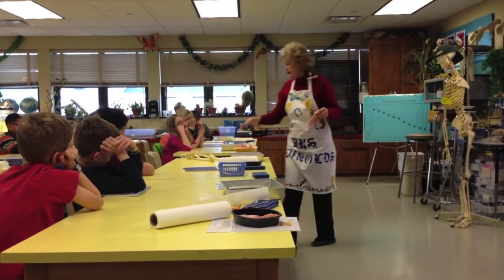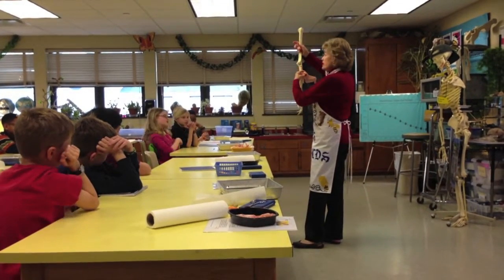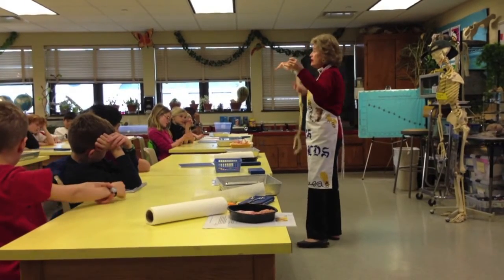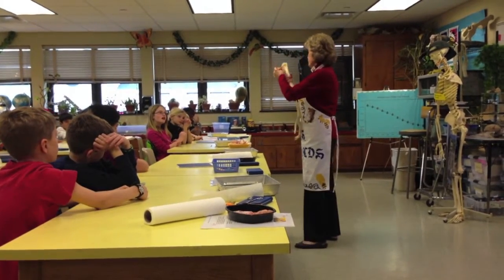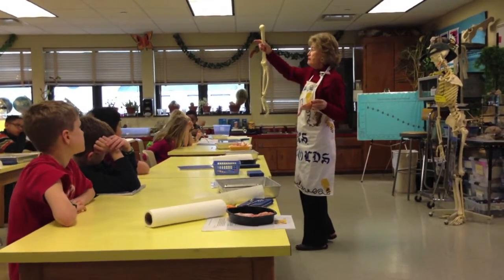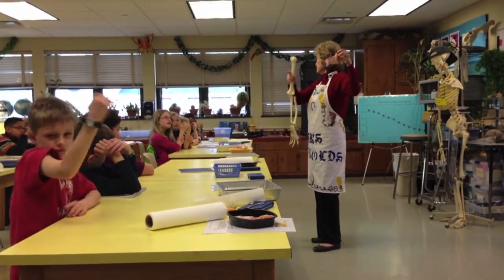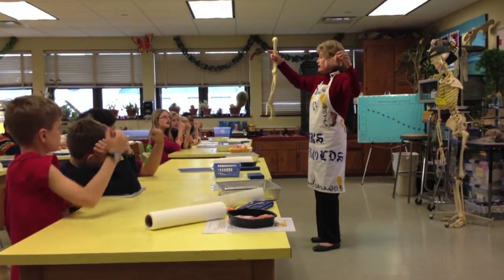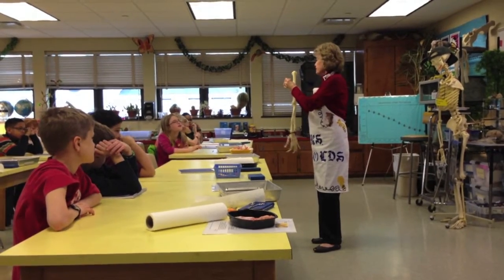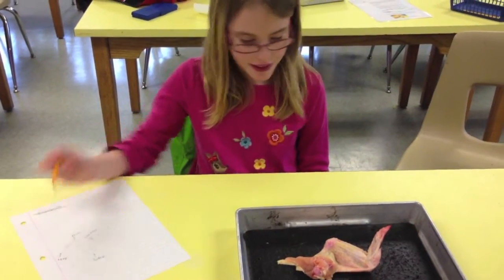Looking at the skeleton, notice that these are two bones here. They're the ulna and the radius on a human. Guess what? They're in here, and they're the ulna and the radius on this chicken wing. Now, this big bone is right here where you like to flex your muscle — that's the humerus. We've got a humerus here. The bone structure is very similar.